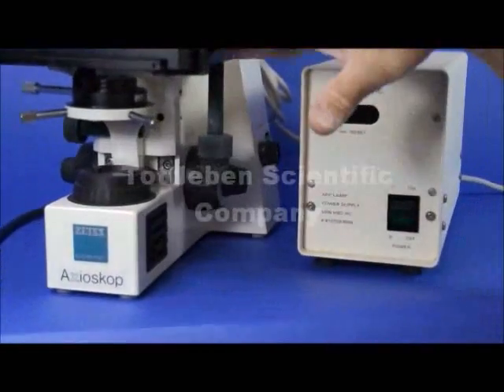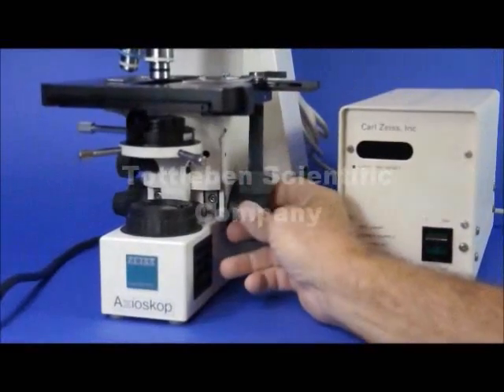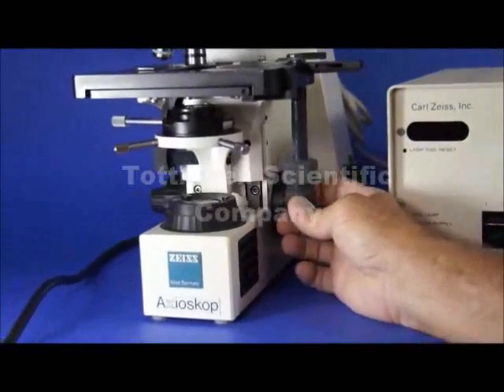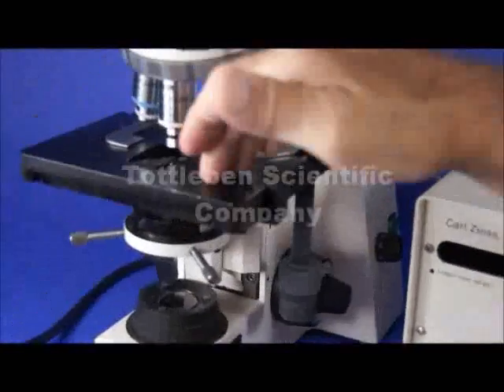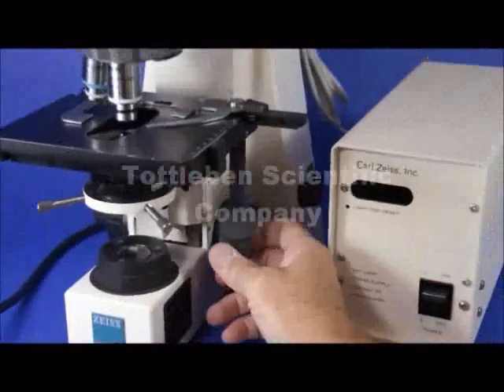Moving on down, you've got a nice low-position coaxial stage. The coaxial drive is very low, which makes it comfortable for somebody who wants to leave their hand resting on the table while they're focusing. It also has a specimen holder with a nice metallic finish. Everything is in very, very good shape on this microscope.